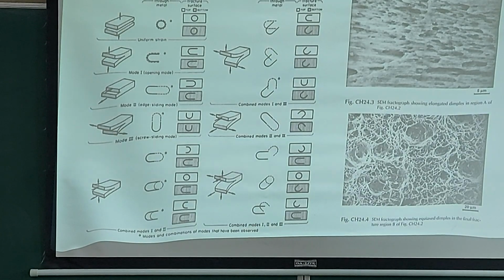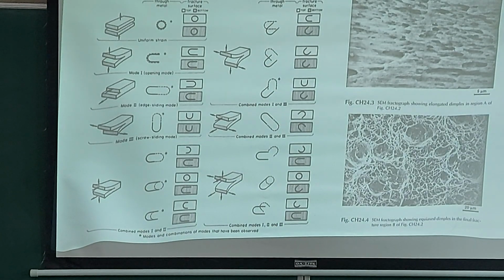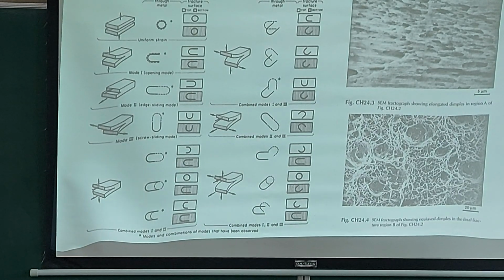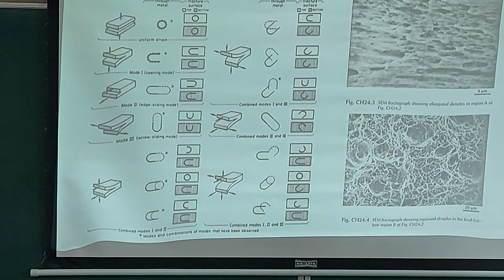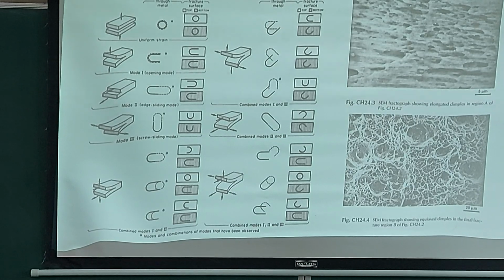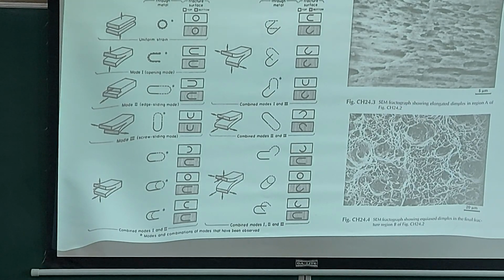It cannot tell you how brittle the material is. If there is a brittle fracture, you will not see dimples. What will you see? You don't know. What will you see? So in this schematic, you see how the dimples will look because of different loading conditions.